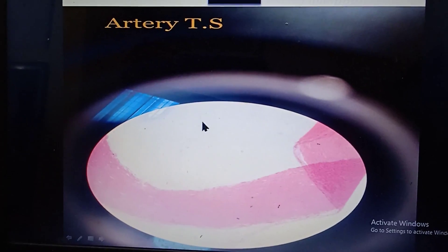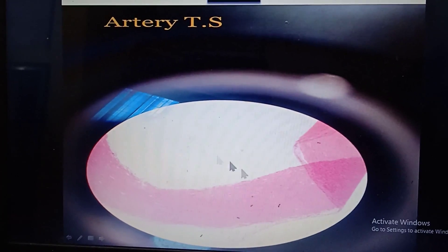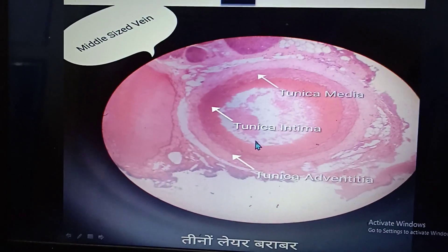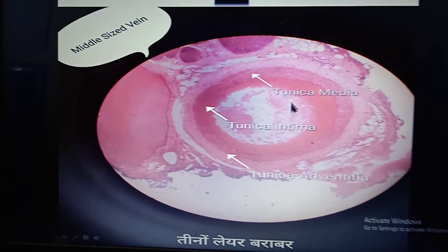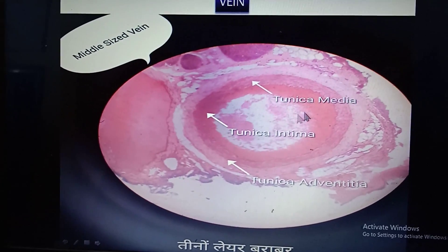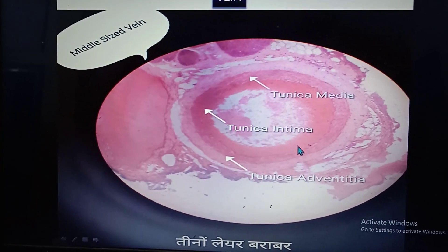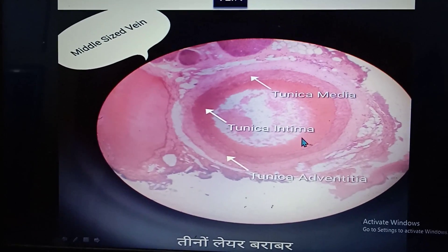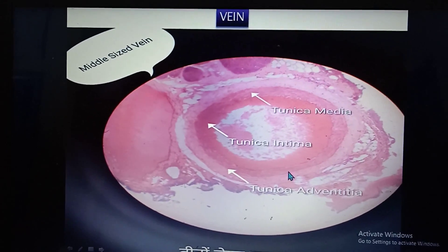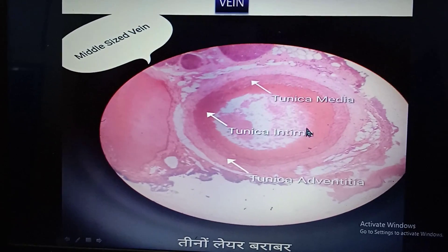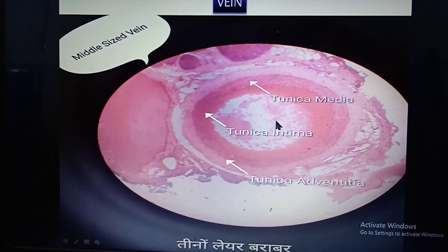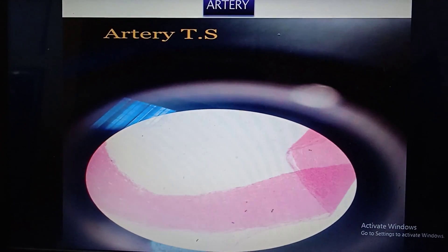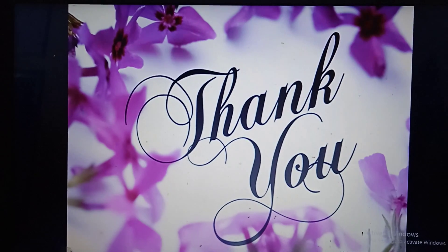Now blood vessels. This is an artery — when there is no blood inside the lumen it is an artery, which is very characteristic. When there is blood within the lumen it is a vein. Both artery and vein have the layers tunica intima, media, and adventitia. What is very characteristic is that inside the vein there will be blood cells, whereas in the case of an artery there will be no blood cells. Thank you.